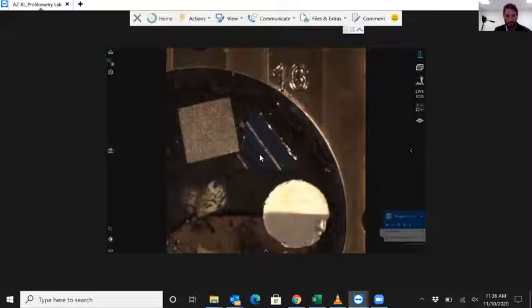So that solar cell that I was showing you earlier, this might actually be a good one to show you. If you guys recall that blue solar cell we looked at earlier, here it is on my stub. I'm going to go ahead and tell the system to move into SEM mode. So you see how long it takes. It takes a little less than 40 seconds to get into SEM. So for anyone who's done SEM before, that's fast.